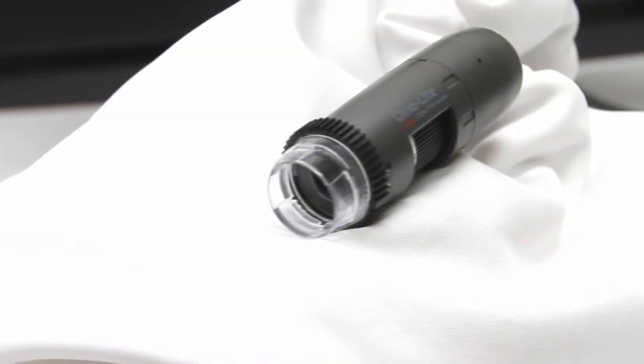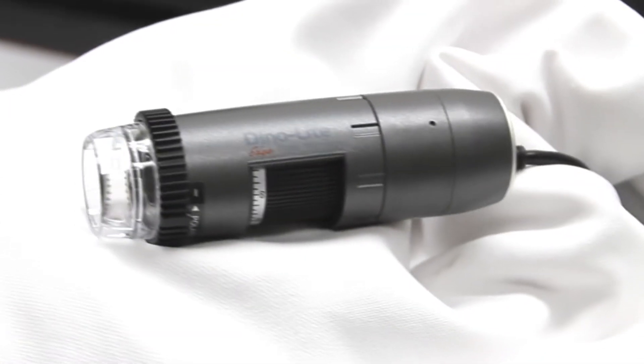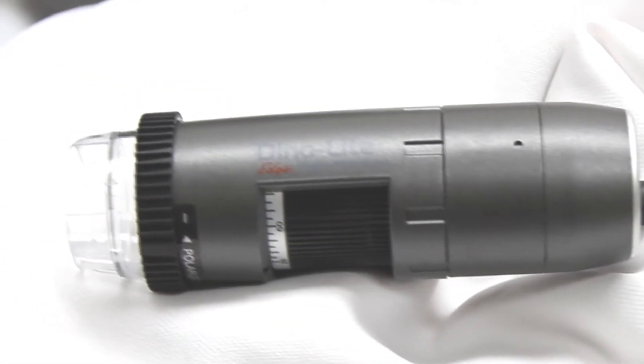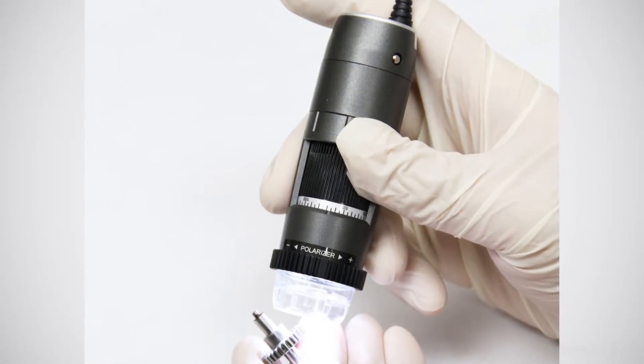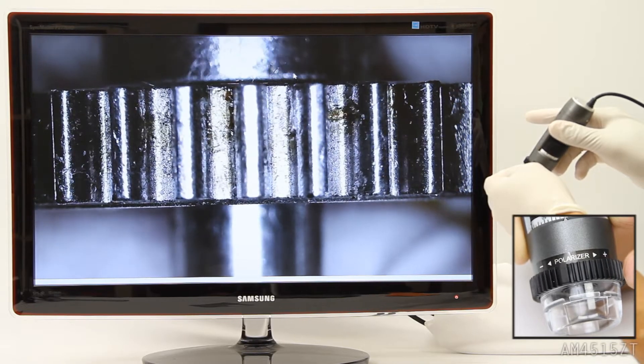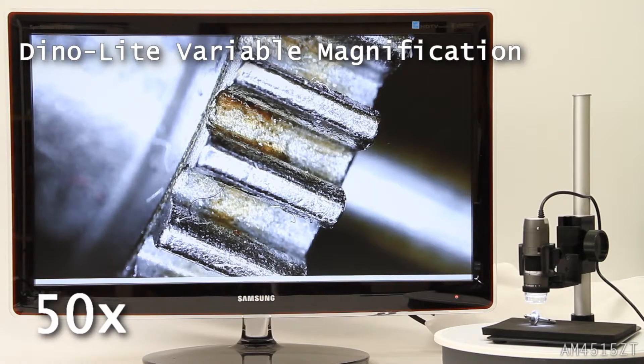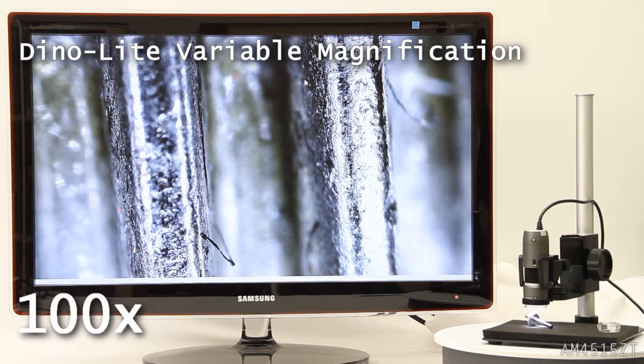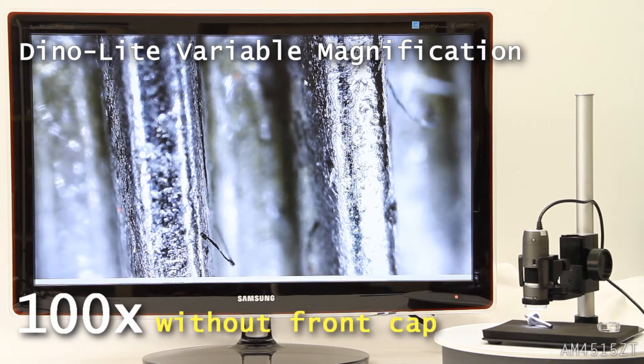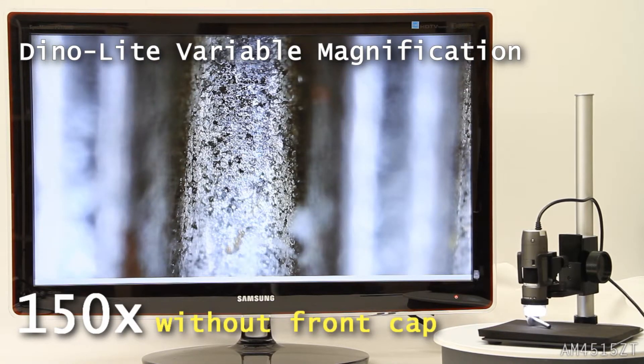Introducing the AM4515ZT Dynolite Edge handheld digital microscope with automatic magnification reading. This model has all of the features of the AM4115ZT including the polarizer, but also displays a live magnification reading in the DynoCapture 2.0 window.